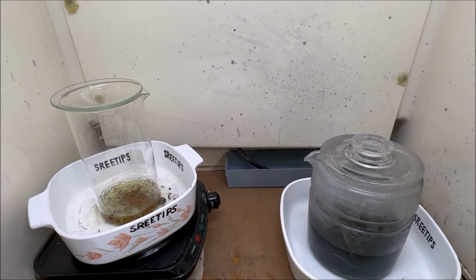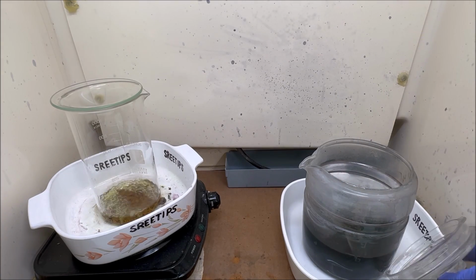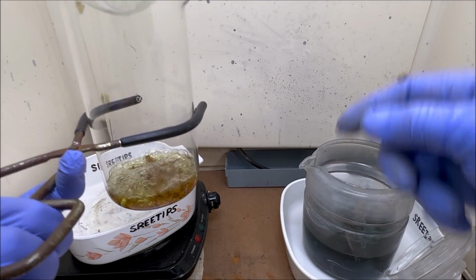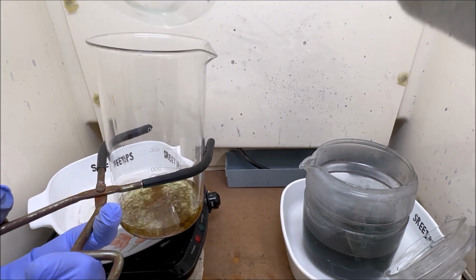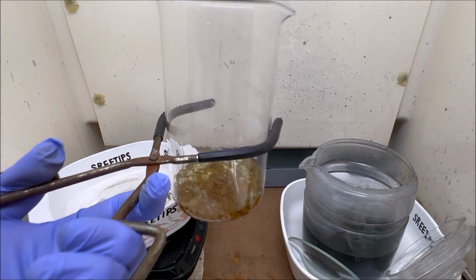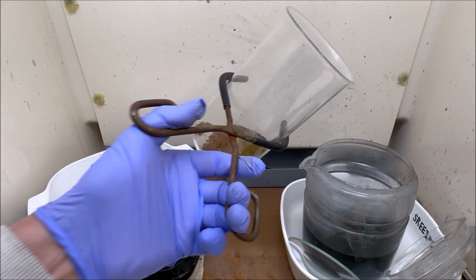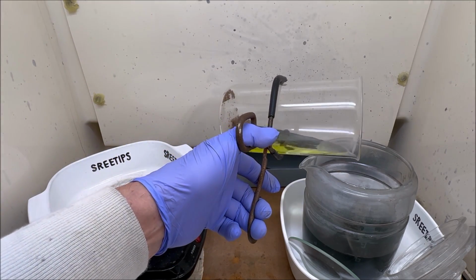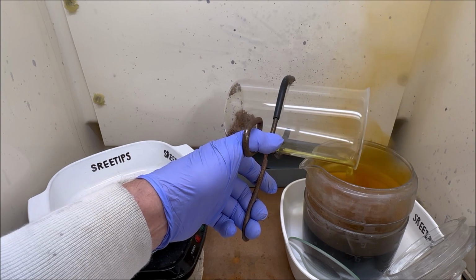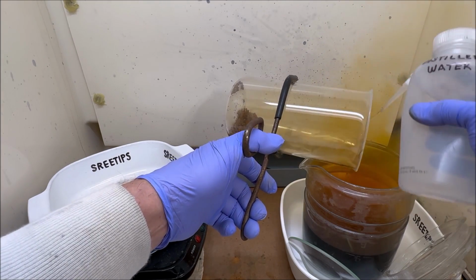What I'll do now is take this nitric boil. This is about the 5th or 6th nitric boil on this gold. And I'm going to pour this off now into my silver jar, even though there's a little gold in there in solution. I'm adding this to my silver jar, and we'll recover the gold later on when we process that silver out of this silver jar.